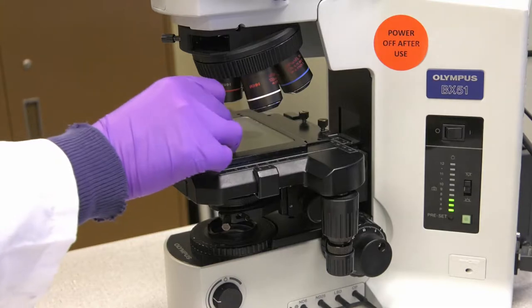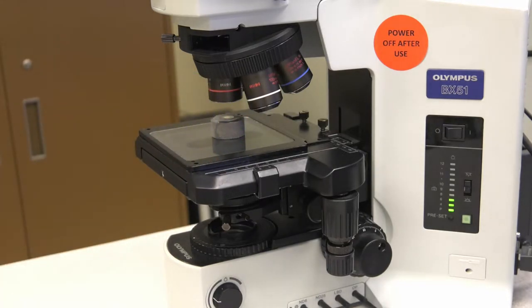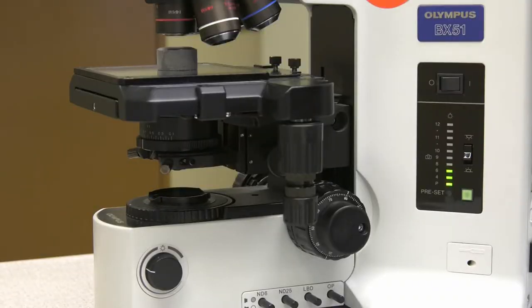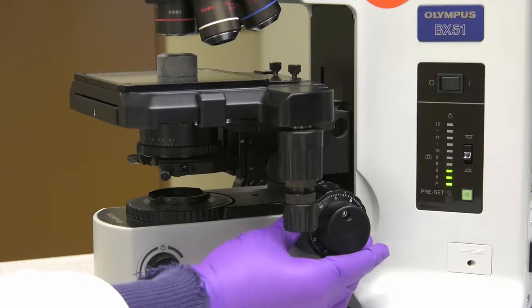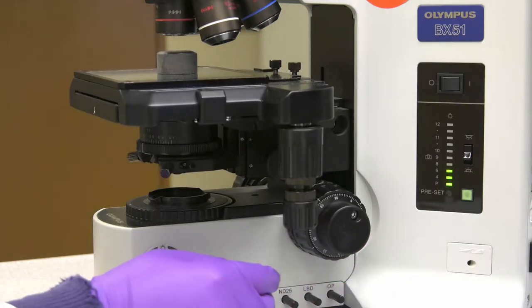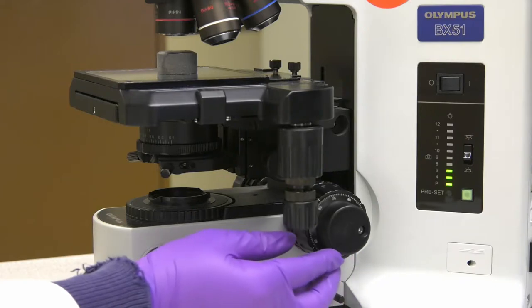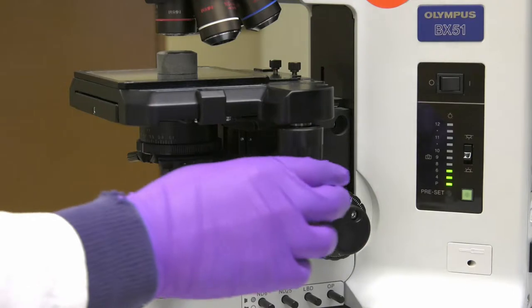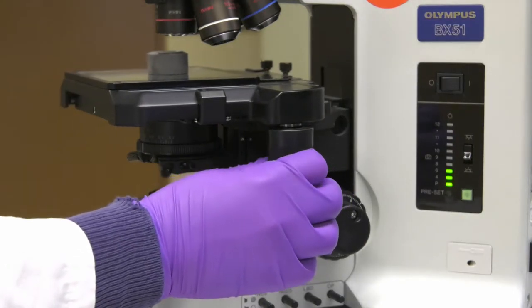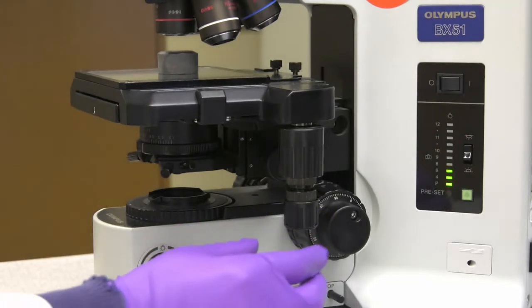The sample is placed onto the sample stage underneath the objective lens. The sample stage can be adjusted in the Z direction by turning the outer knob and finally adjusted by turning the inner knob. These adjustments are used to put the sample into focus. The X and Y axes of the sample stage can be moved by turning the knob on the side of the sample stage.